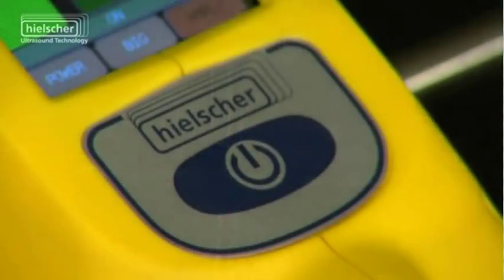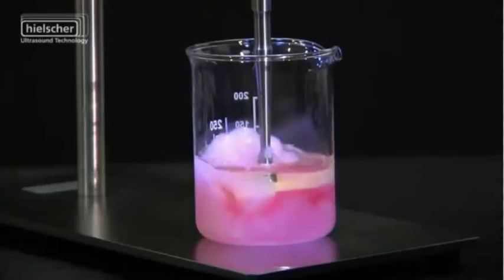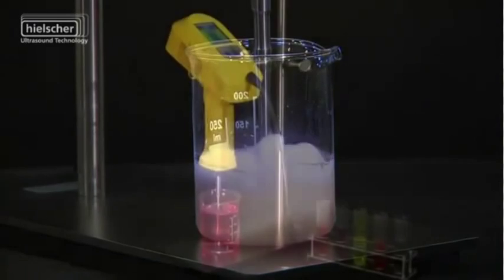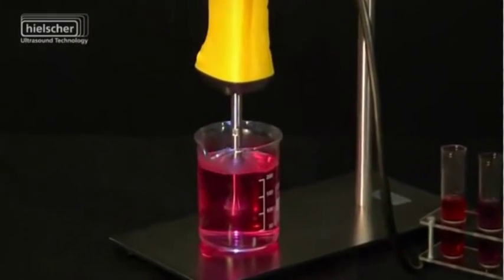Hielscher's ultrasonic homogenizer UP200HT is used in professional laboratories for sample preparation, homogenizing, dispersing, and de-agglomeration.